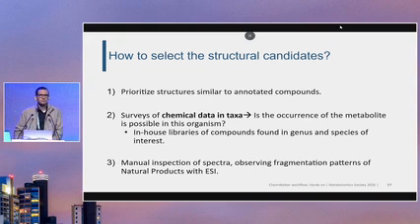Quite interesting, but this is related to the earlier presentation. There was this threshold, if I remember the number is 50,000. Would this threshold that you choose for identification of different potential compounds be dependent on the platform, dependent on the sample, or dependent on how you process the sample and the data in MZmine? Is there a rule of thumb, or do you try and see, trial and error?